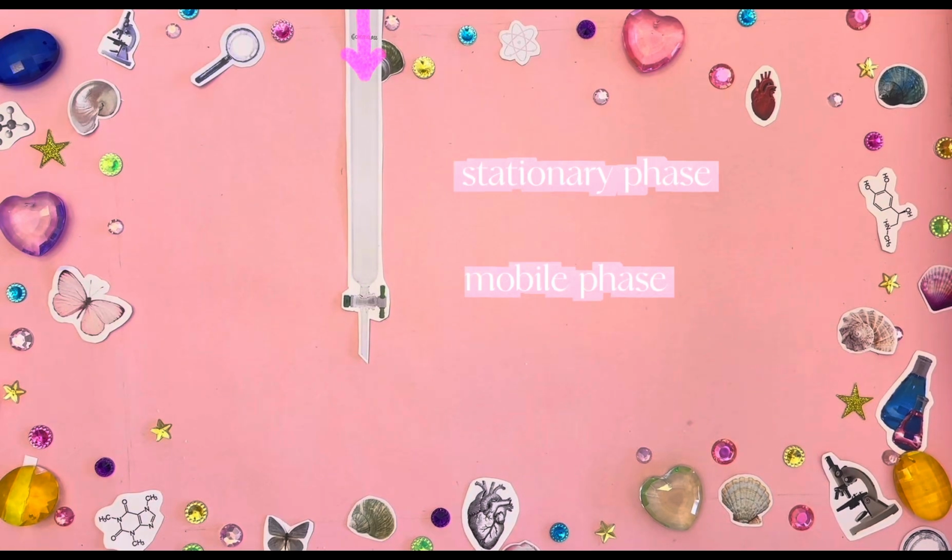Molecules will differentially interact with the stationary phase depending on their properties. Those that stick more strongly will take longer to flow to the bottom and out of the column. As they come out, or elute, at different times, they can be collected separately, and you will have successfully isolated your target components.